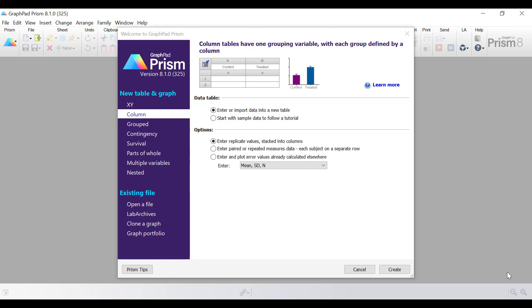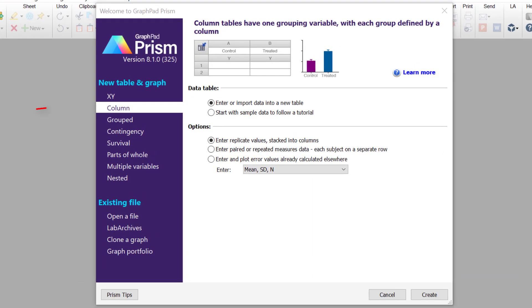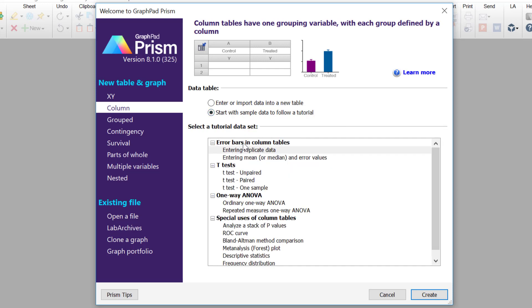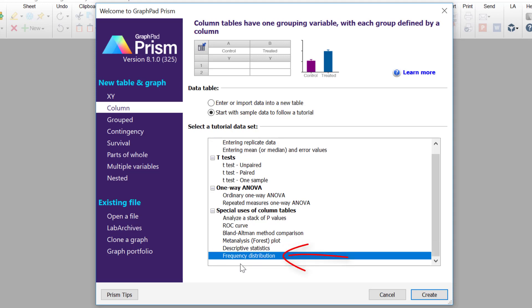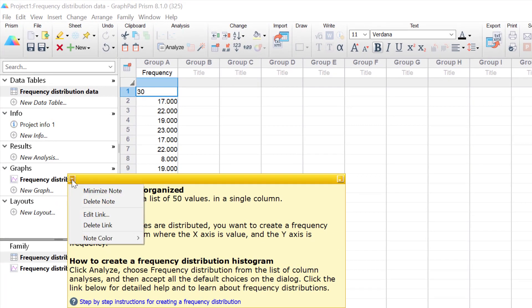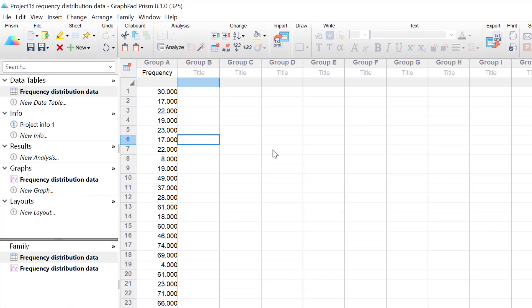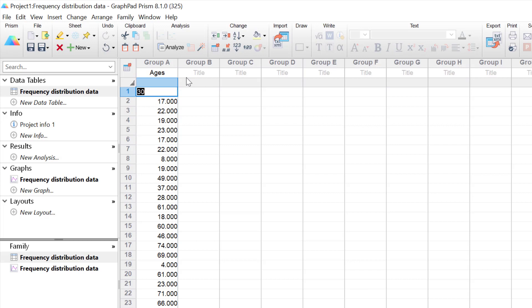So let's go ahead in GraphPad and create a frequency distribution of some example data. I'm going to select a column table and graph, click start with sample data to follow a tutorial, and under the special uses of column tables select the frequency distribution option, then click create. I'll minimize the note displayed here. In this dataset there are 50 individual data points, and I'm going to rename this as ages — so we're pretending these are 50 individuals of different ages.